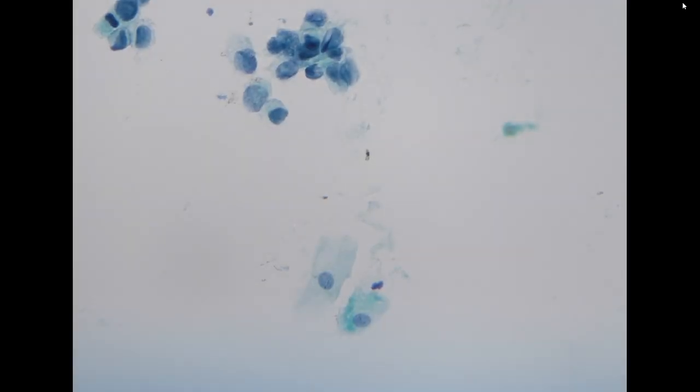So this is a urine specimen. So this is a cytospin preparation. As you can see, the cells were concentrated at the periphery of this circle. And there was a spot that you can see.